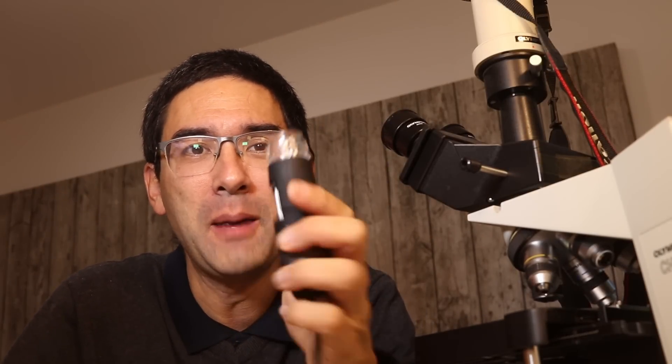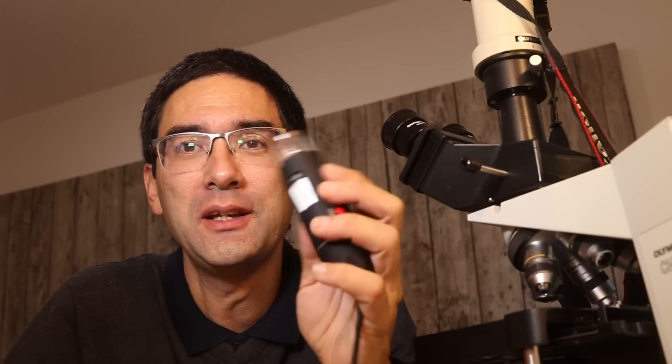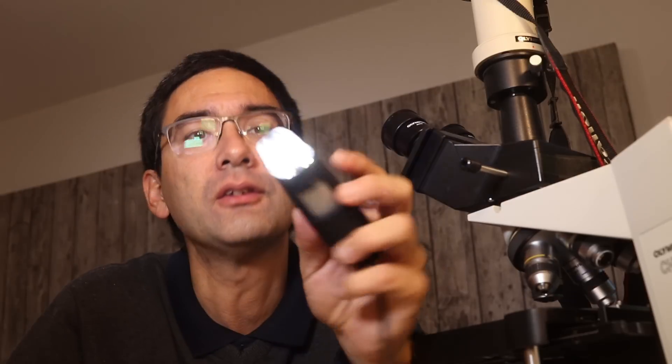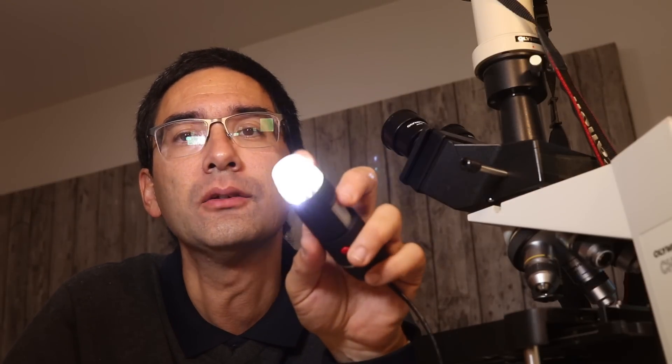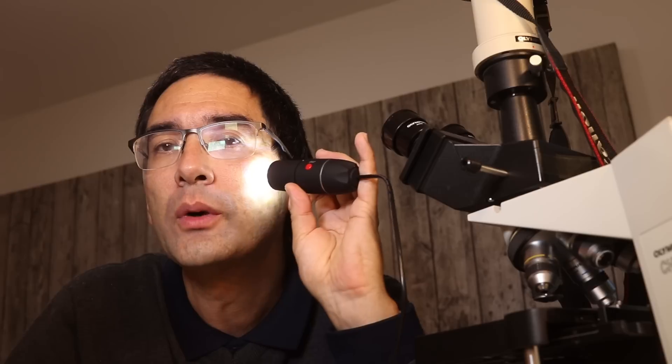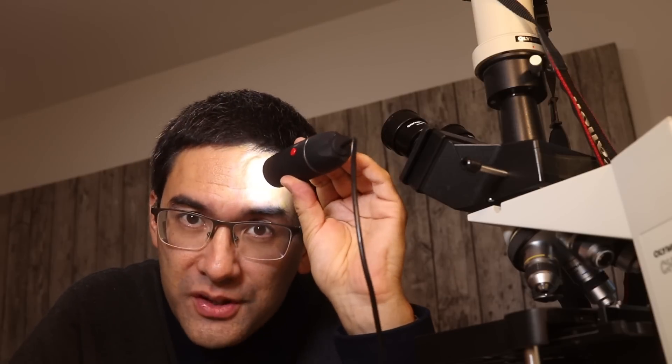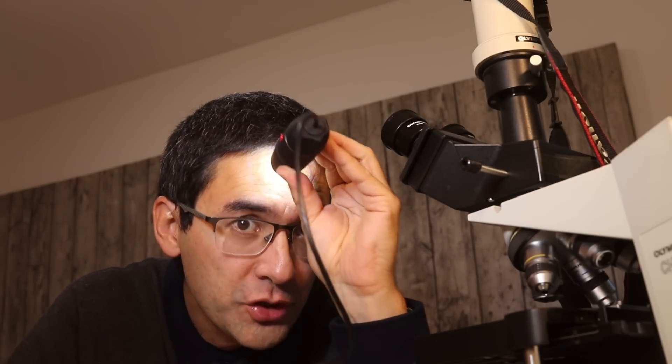Hi Microbe Hunter here, look what I got. This is the microscope that I'll be using to explore my skin. You can switch it on and see there are eight LEDs here in front. When you point at your skin or whatever object you're interested in, you can see the picture on the computer screen.